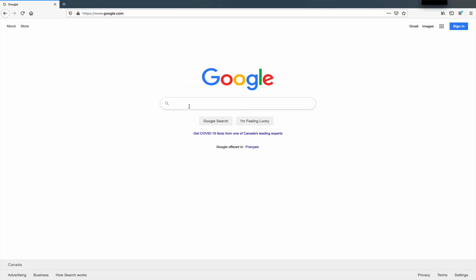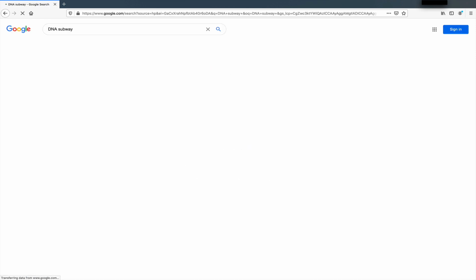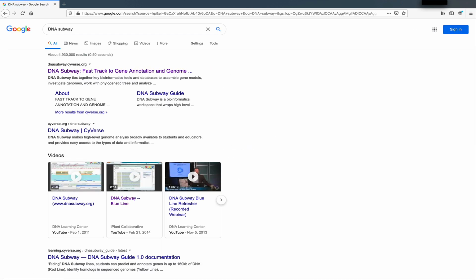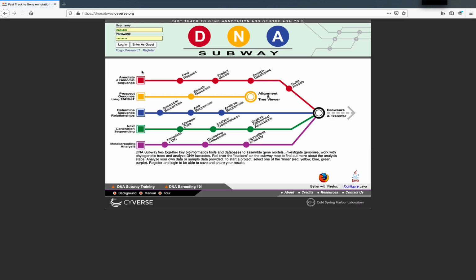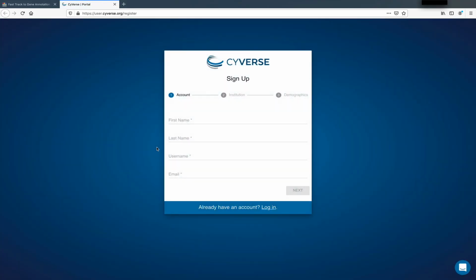On Google, type DNA Subway and click to search. Choose the first search result and click. This shows us the DNA Subway website. The first thing we need to do is to register and create an account. Click Register and fill out all the required information.